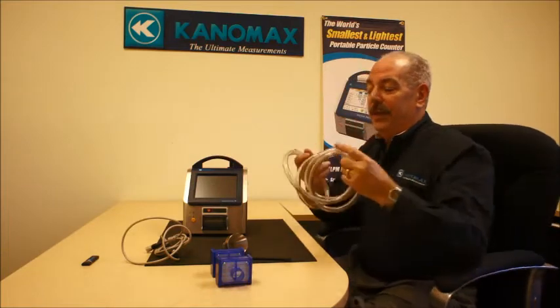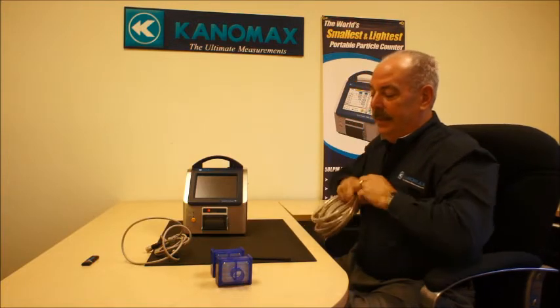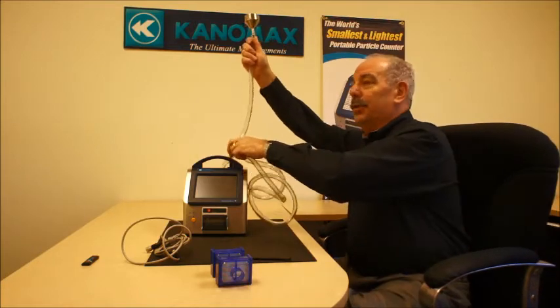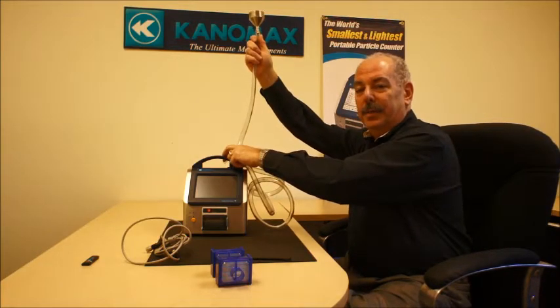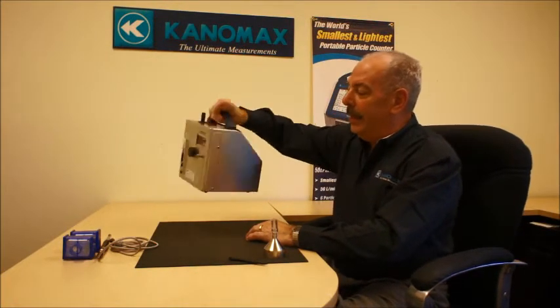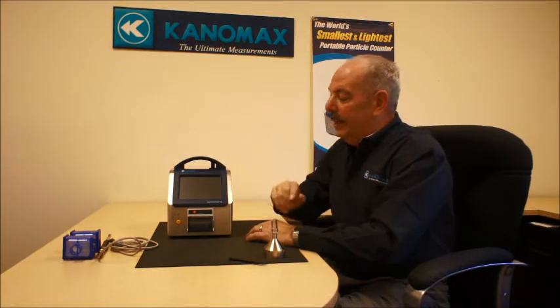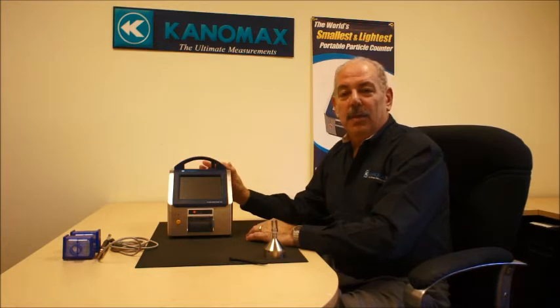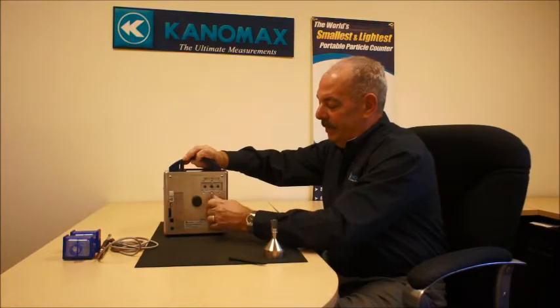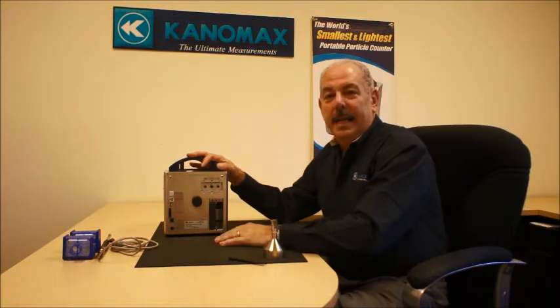The unit comes with a two-meter hose so you can connect the isokinetic probe to the hose and take the measurement up to the point where you need to actually measure. The 3910, which is represented here, is very lightweight and small, easy to operate. The unit itself is all stainless steel enclosure and has the ability to operate on lithium-ion batteries, located in this position, as well as an AC adapter.